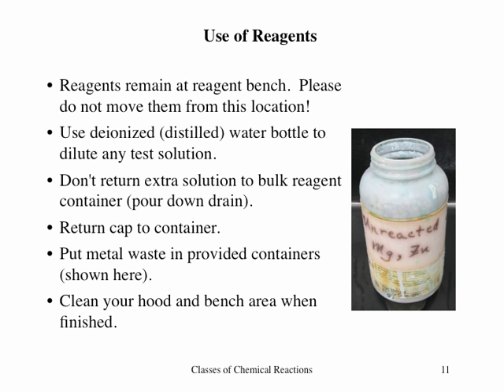Please do not remove any reagents from either the reagent bench or reagent hood. This allows everyone in lab to easily find the reagents. It also provides a safe lab environment for everyone. Use deionized water from one of the marked containers in lab to dilute any test solution. Don't return any unused solution to a bulk reagent container. This is how reagents become contaminated.